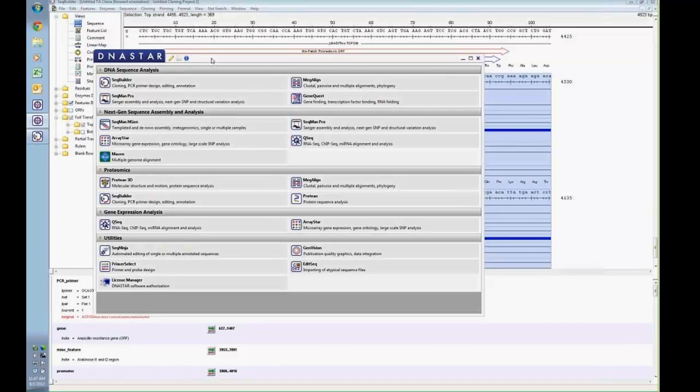But based on my experience, if you're working with an expression vector from a specific vendor, they've already specifically optimized and made sure that whatever restriction enzyme they've selected is in frame with that promoter that they're recommending for expression. But you have the option to select whatever enzymes that I want to apply to my project to be used for cloning.